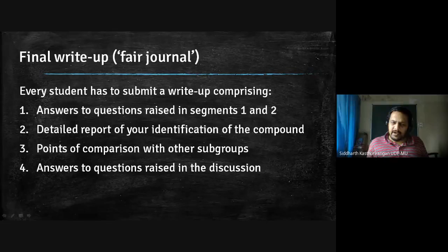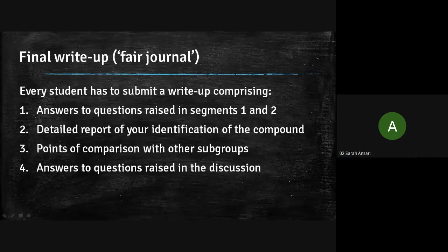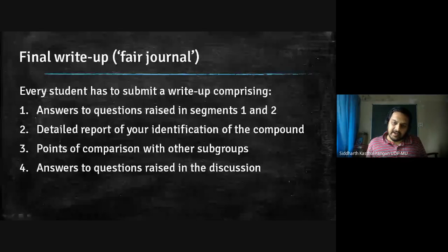Okay. But the surrounding of the H is different. So in isopropanol you will get only 2 peaks. In propanol you will get 3 peaks, and one of those peaks will be further split. So you will get basically 4 peaks. In isopropanol you'll get only 2 peaks in NMR, means 2 major peak clusters basically. Okay. Good, but very very good question and very correct understanding from your side.